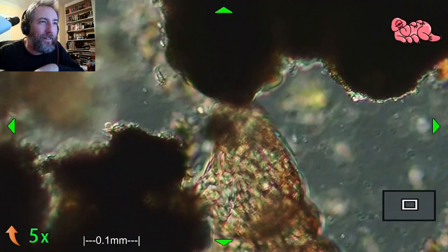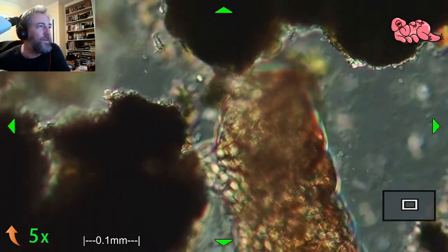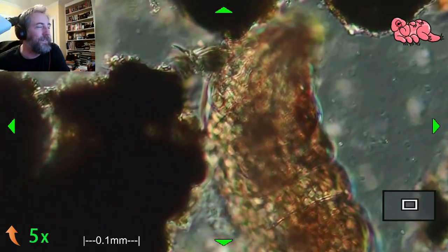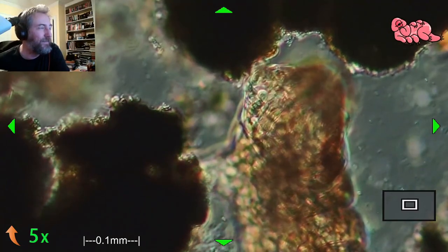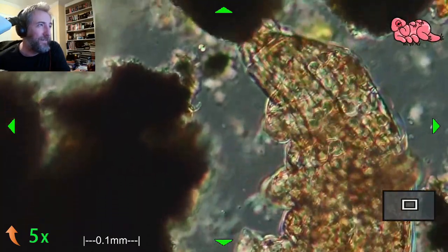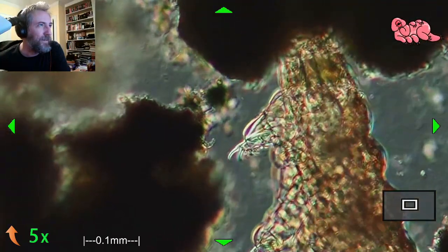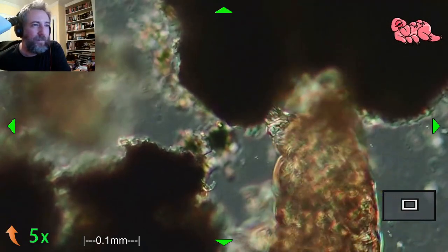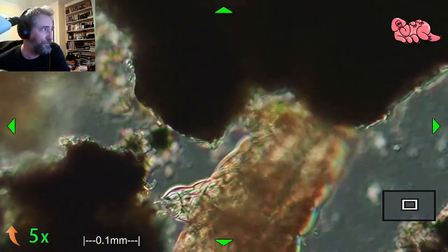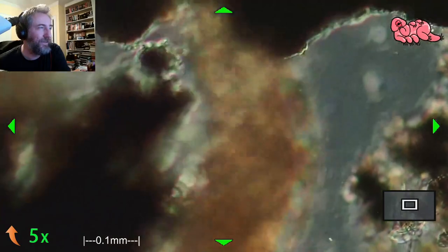Neon Coffee Cat, hi. New here, is that a tardigrade? Yes, it is. So water bears have eight legs, and tardigrade is the tardy, I think. Tardigrade is pretty close to the group that they're in, which is their own group. They're their own thing. Not an insect, not a spider, just their own little thing. Yeah, they don't belong to the arachnids either. They got their own little group called Tardigrada.